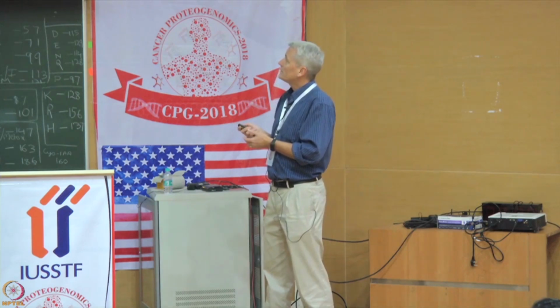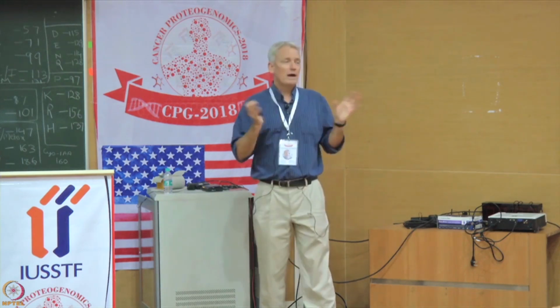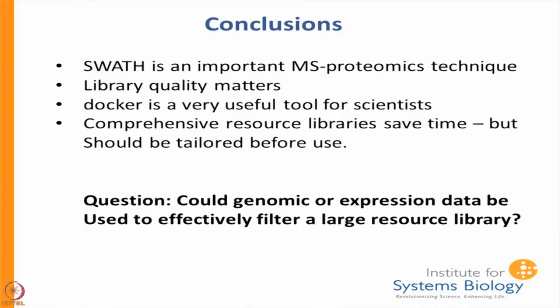And again, I think that leads into proteogenomics, because what if you had some genomic data, and then you took one of these resource libraries and you said, okay, I think that my genomic data tells me that I should see all these things. And so now you make a much more focused proteomics library, and you have a better chance of actually seeing what you're looking for.